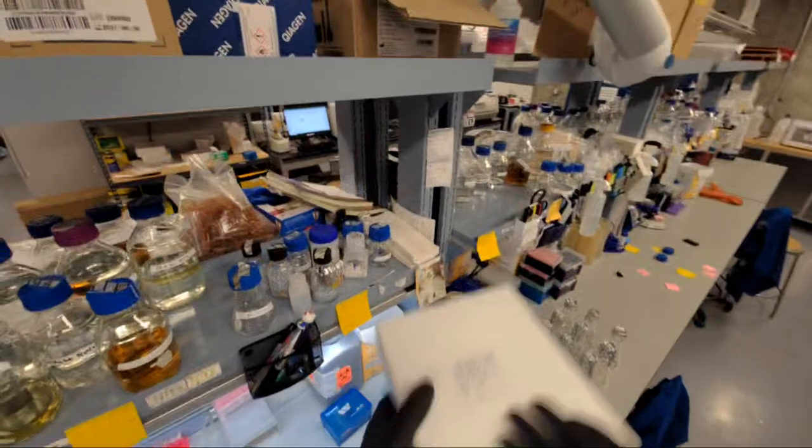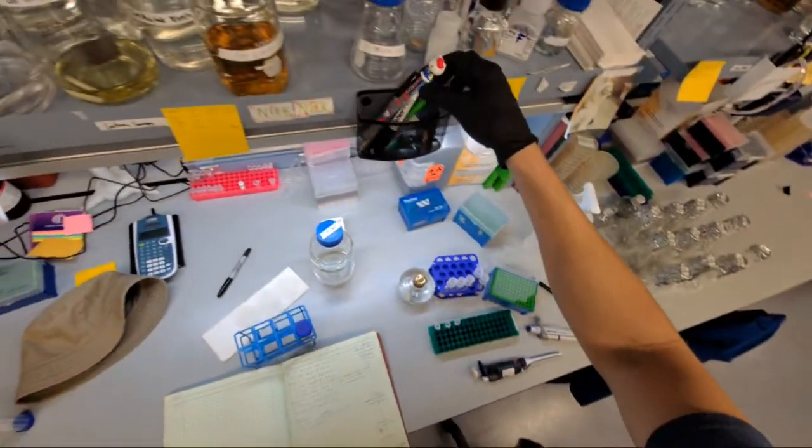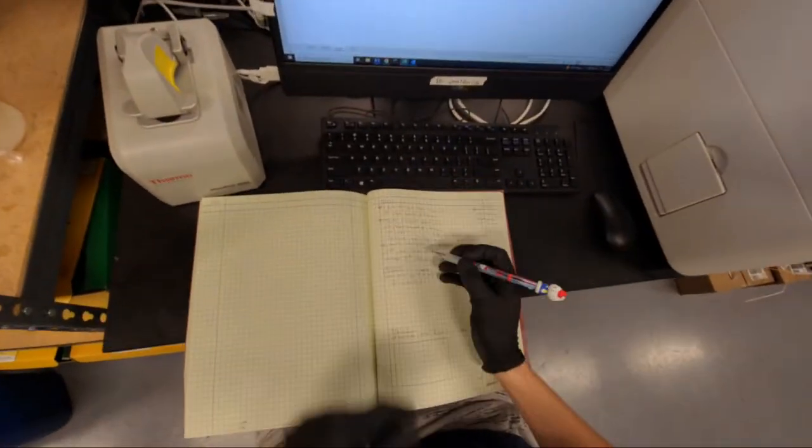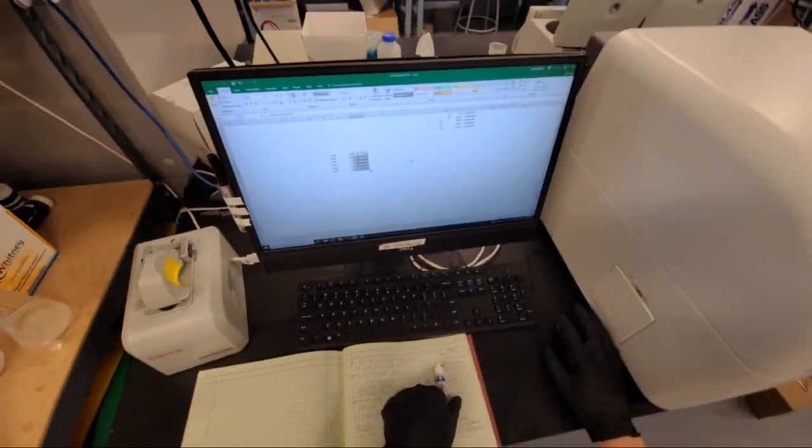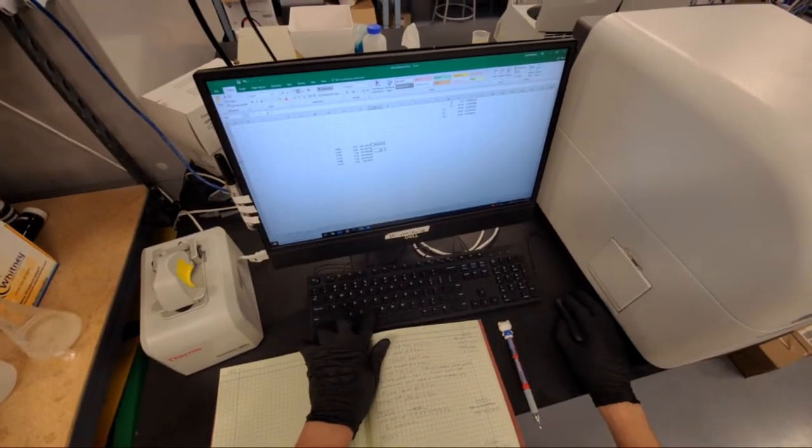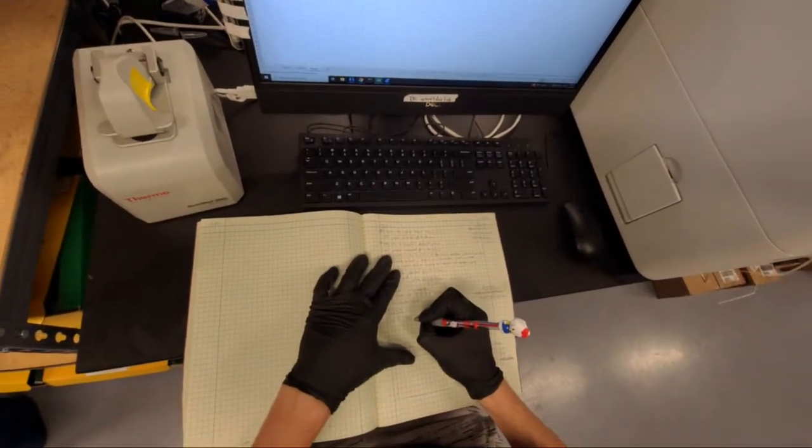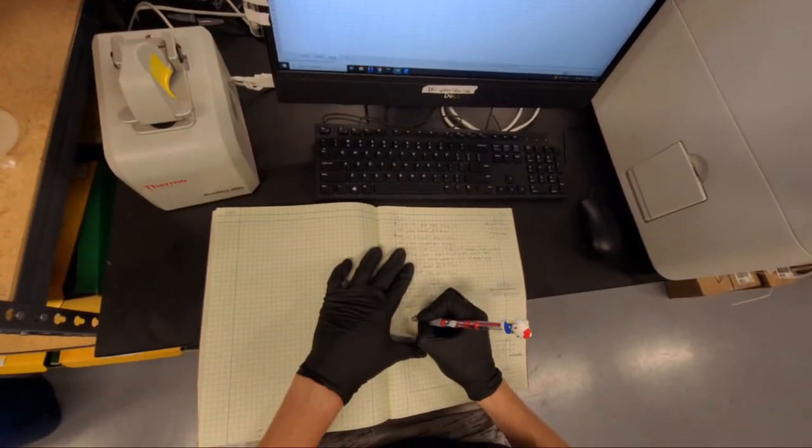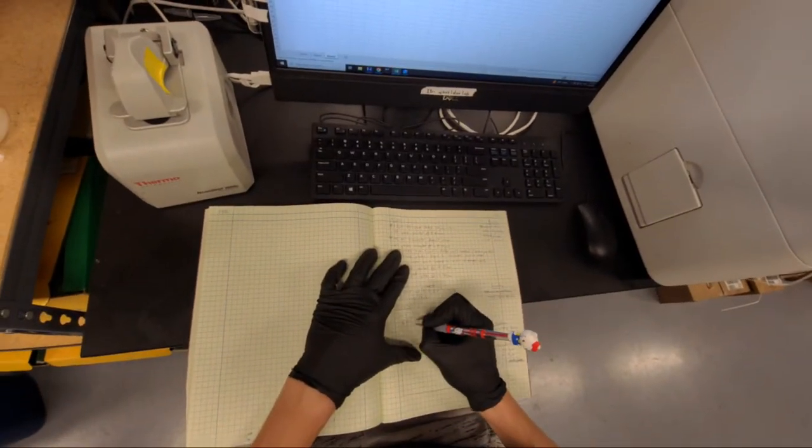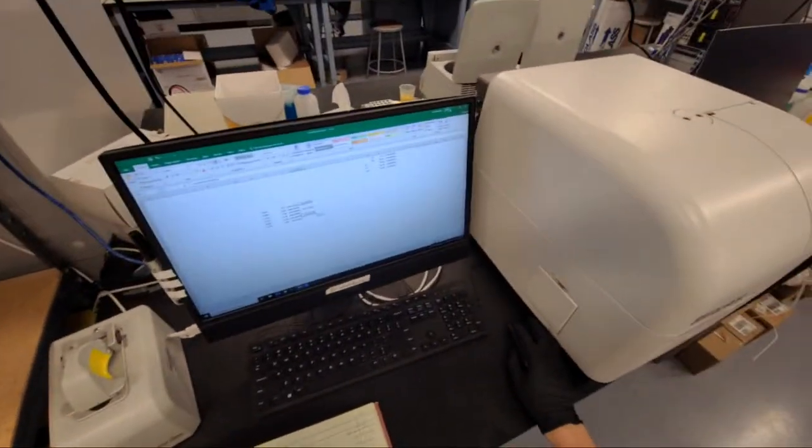So I'm going to throw these away. These you can reuse, but they're like 10 cents each or something like that. So it's not a big deal. So we need to write down these numbers to inoculate these flasks. Today is the fourth, I believe. It's the fourth. And we do want to average these readings too, because we took two for each. So I'll average those. So we got wild type. We need 140 microliters. For EF, we need 180. And for EJ, we need 222. That means we have enough of our culture.